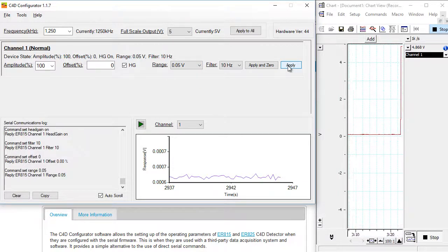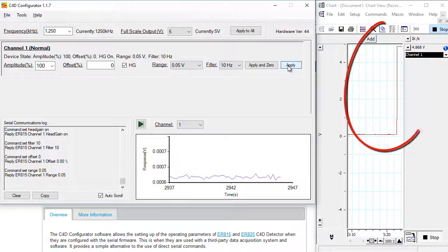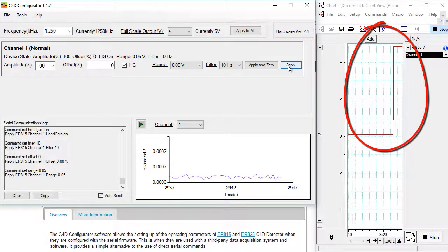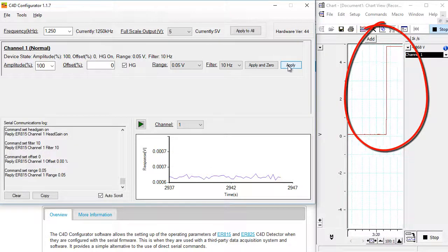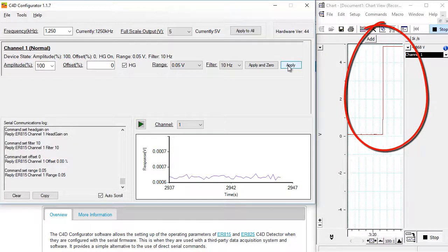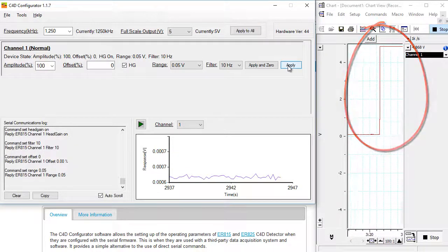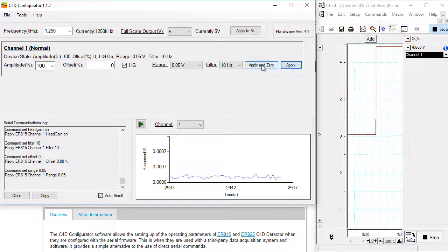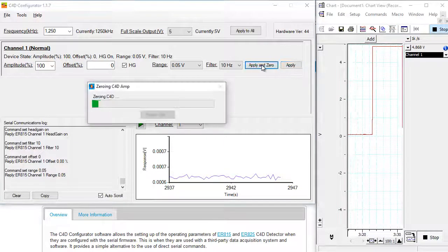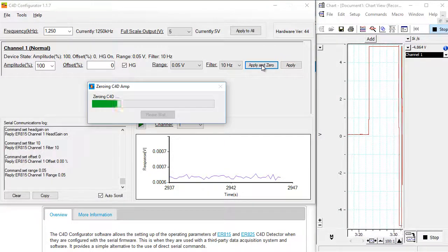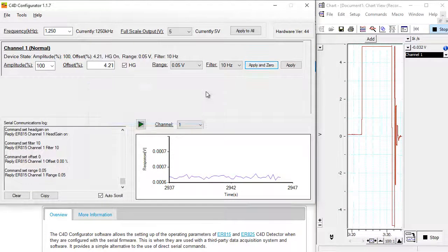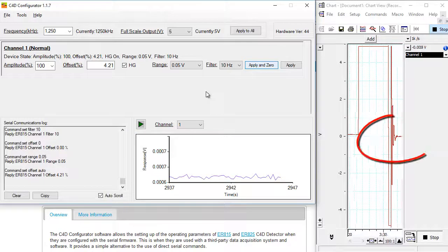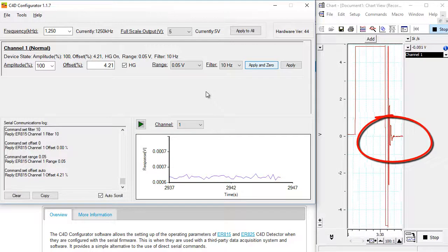If I click apply, you can see my data acquisition software has recorded that change. I'm going to now click apply to zero, and it's going to zero the signal. So you can see it's gone back to zero.